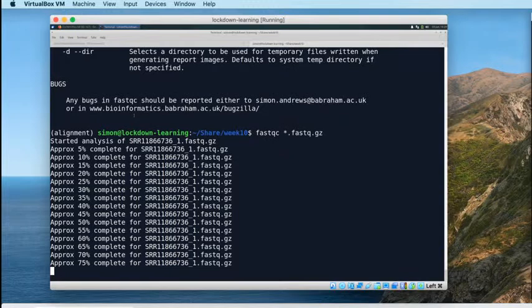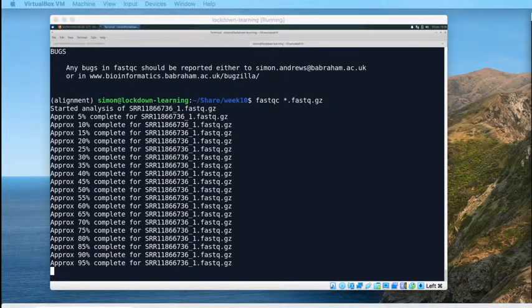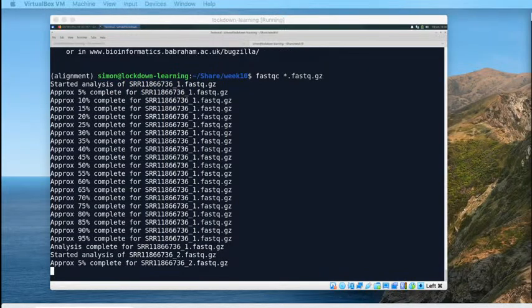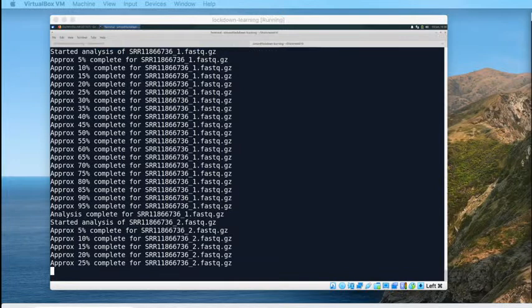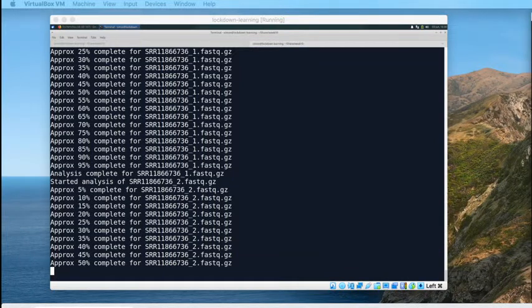So this is running FastQC, and FastQC produces reports. If you remember back to the appropriate session, which I think was about number 13 or so, maybe a little bit later actually, we introduced FastQC and we looked at the reports. There you go, session number 18 was when we looked at the results of FastQC. And the one before that, session number 17, we looked at running FastQC and running MultiQC. Admittedly quite a long time ago, but we have looked at these reports in detail before.